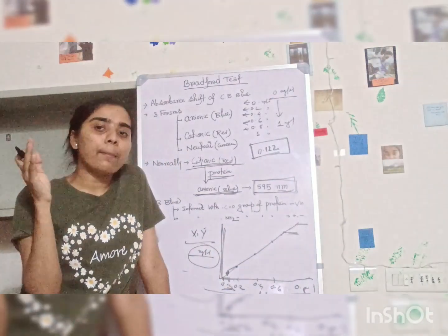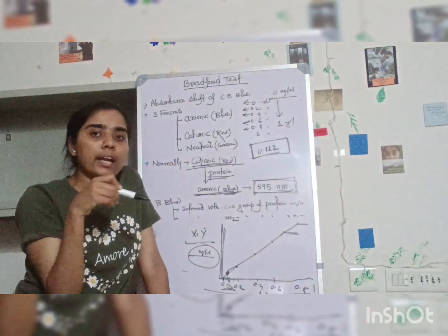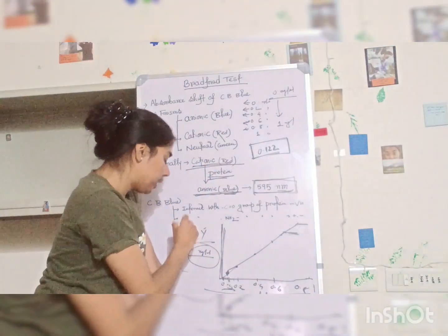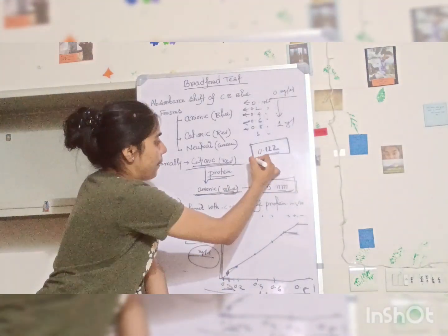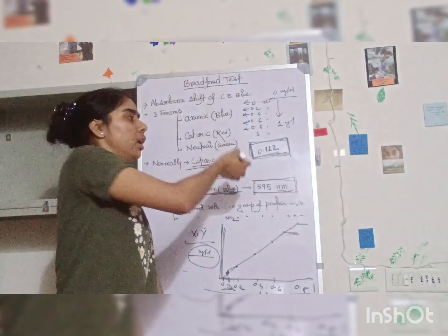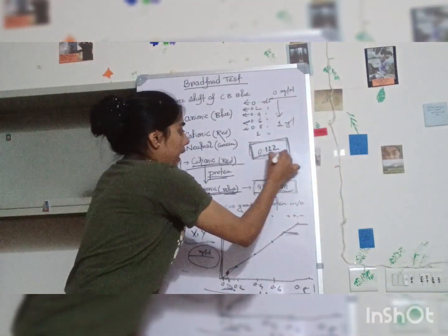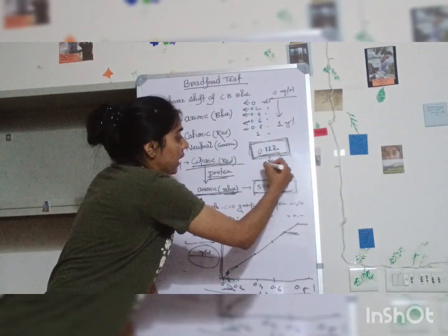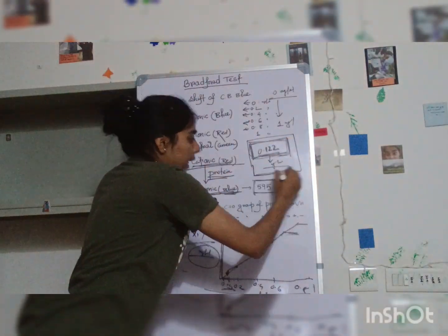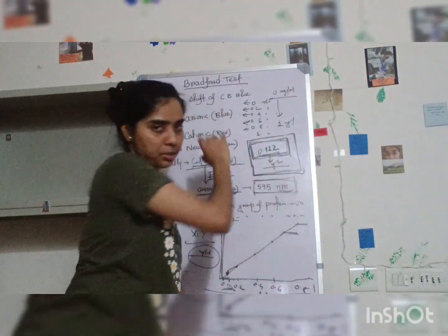If you have any confusion, you can just let me know in the comment section. I can give an example from one of my assays where I detected the protein concentration from this absorbance value, because I can get this from the computer which is connected to the Bradford machine. But how you get the mg per ml, that is the protein concentration, is one task as well. So if you don't know how to calculate it, let me know in the comment section. I will give another video on how we can calculate from absorbance to mg per ml.